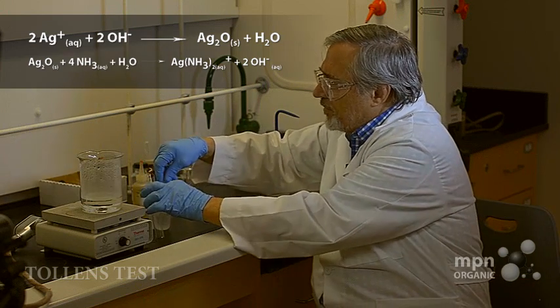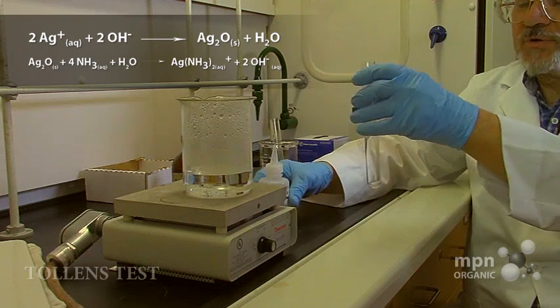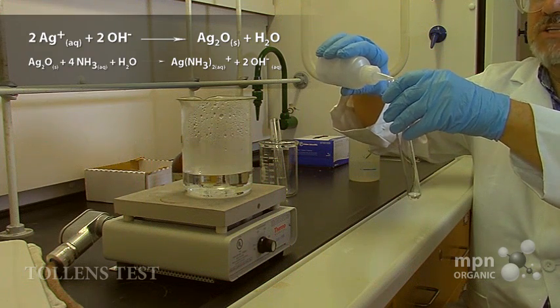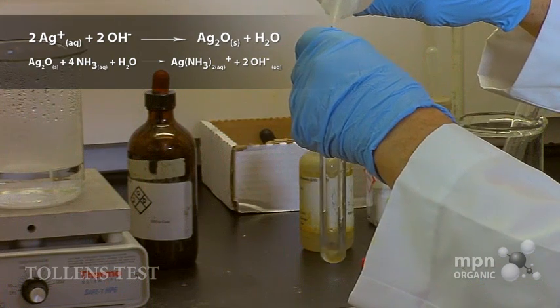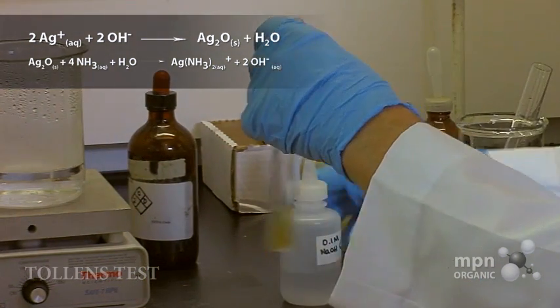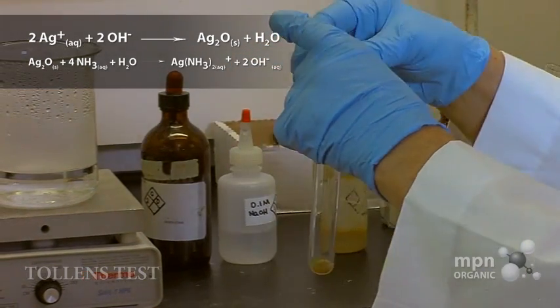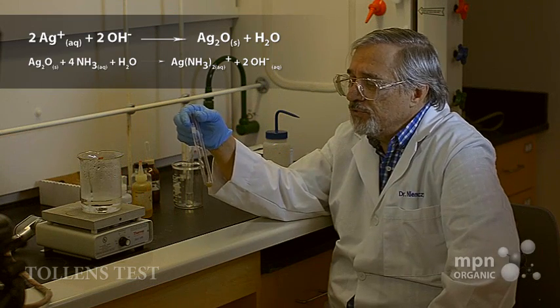And we're going to put in a couple drops of sodium hydroxide. For all of you who have taken qualitative analysis in general chemistry, you'll know that what happens when we add sodium hydroxide to silver nitrate is we form silver oxide, Ag2O.